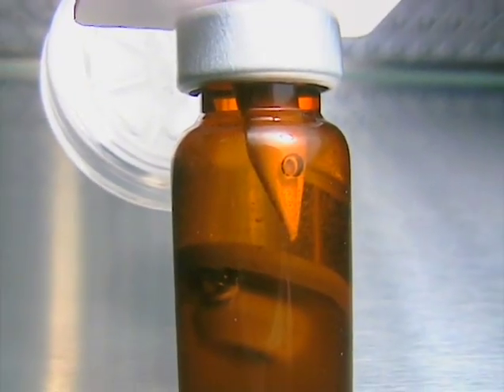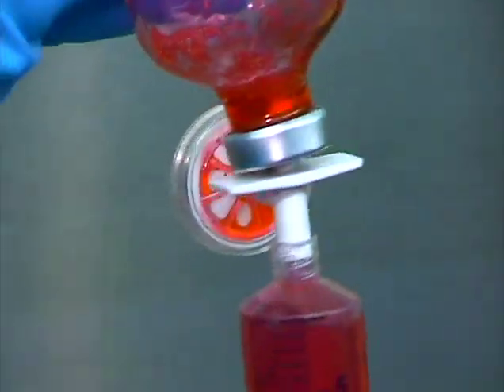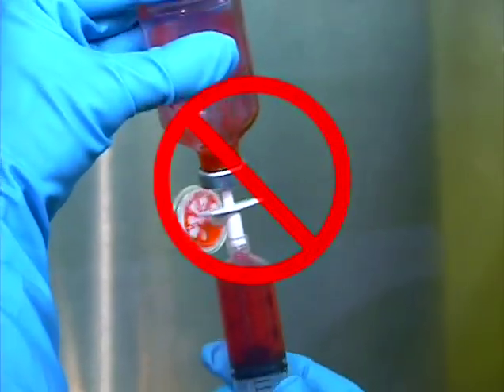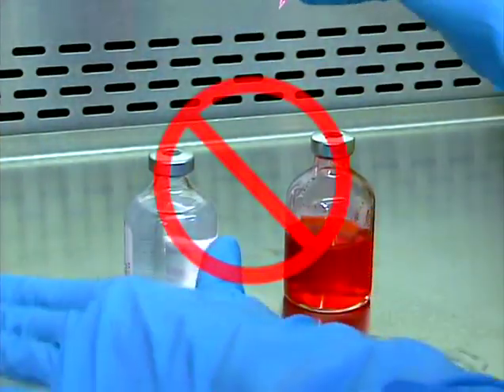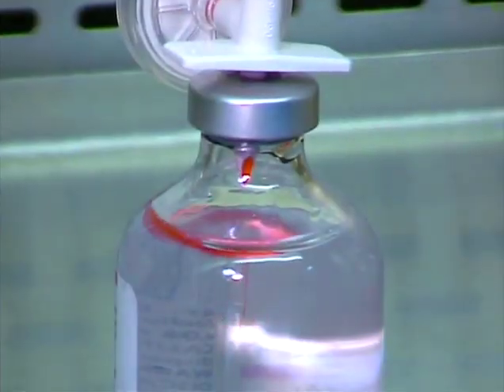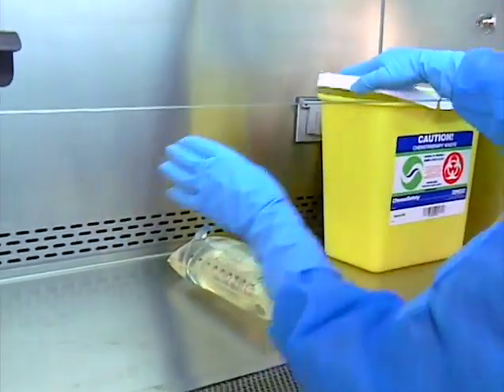Please note that dispensing pins may not be appropriate for very small vials. The thick pin may push the vial stopper into the vial rather than puncturing it. Also, not all drug can be removed with a dispensing pin due to the height of the inlet holes. It is not acceptable to wiggle the pin back out in an attempt to extract more of the drug from the vial. Neither should pins be moved from one vial to another. All vial and dispensing pin assemblies should be capped and disposed of intact.